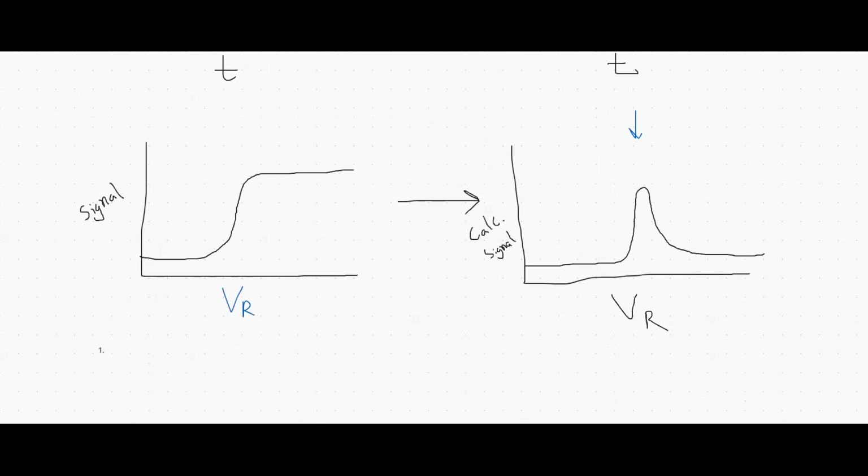This is what your chromatogram might look like when you do pulse qualification, where you inject a slug of some signal buffer. Maybe it's 2 molar sodium chloride or something that has like 1% acetone in it, and you get a nice Gaussian peak. It looks a lot better than what I drew there. This is pretty standard. I think anyone that's packed columns before has seen this.